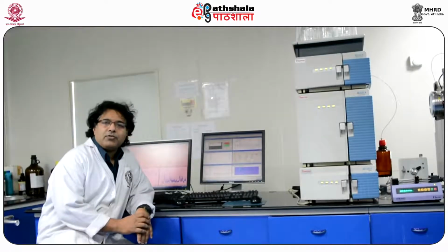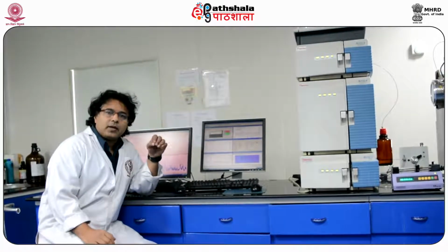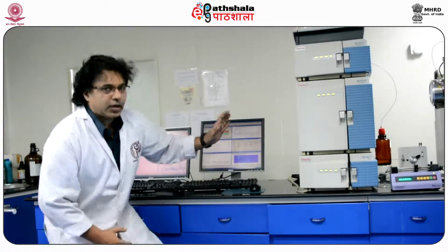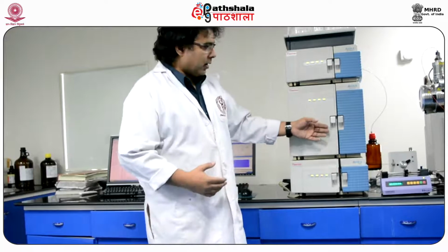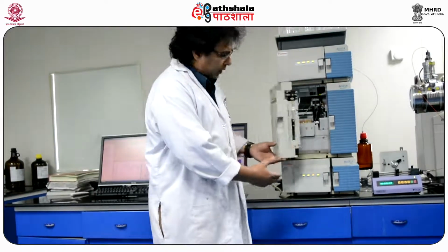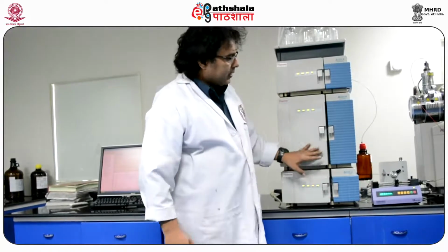This is the lab of high precision bioanalytical laboratory. What you see here is the mass spectrometer, which is a triple quadrupole coupled with tandem mass spectrometry. What you see here is the HPLC, the sample feeder, which tries to isolate the compounds, and this is a complete assembly of it. This is a pump, this is the sample feeder assembly, and this is a detector. And here it is getting separated. It goes to this machine.